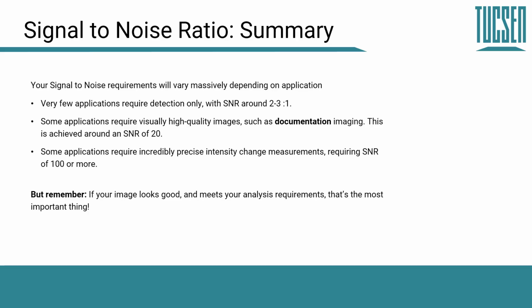But remember, with all of this sort of numerical examining and really focusing on the details of signal-to-noise, the fundamental question is, if your image looks good and meets your requirements for your analysis, that's the most important thing. And you don't necessarily always need to worry about such details if your image is good enough. If you're trying to push things further, maybe it can be very beneficial to calculate signal-to-noise ratio, but it might not be beneficial or necessary for every imaging application.